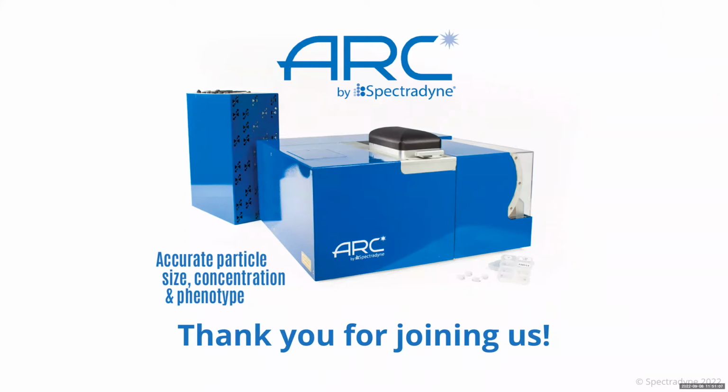And should be compatible with all the flow cytometry standard staining protocols and things.